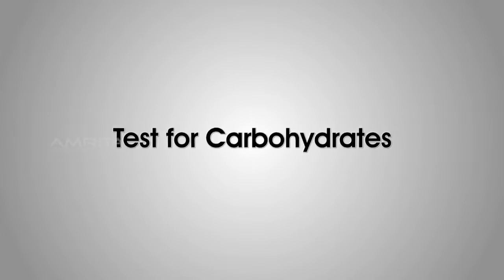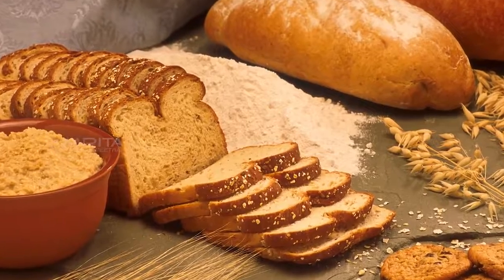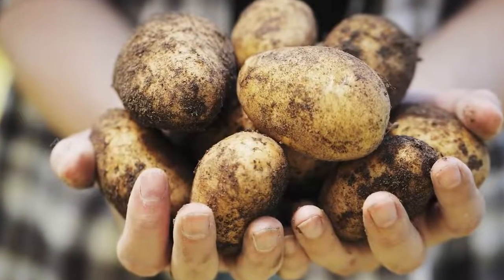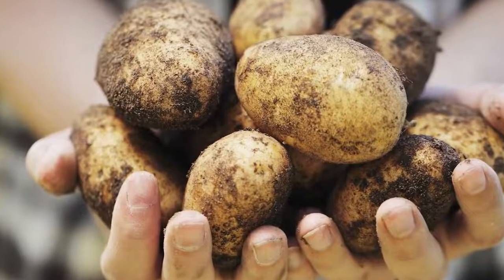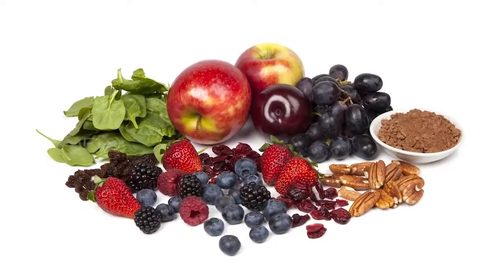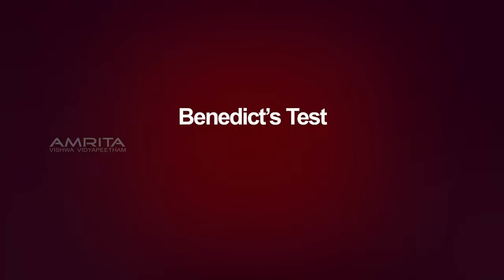Test for carbohydrates. One of the main components of our diet is carbohydrates. Glucose, sucrose and starch are all forms of carbohydrates found in our daily food. Let's start with testing for the presence of glucose in food substances. There are two tests, Benedict's and Fehling's test, used to find if glucose is present.